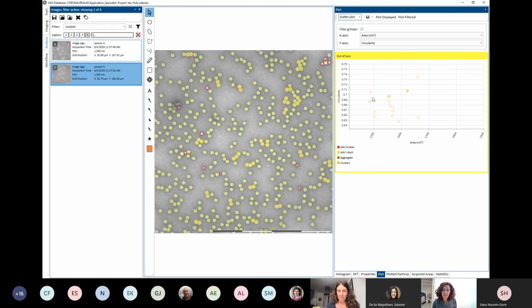Yeah, we like sections. They are a little bit more challenging, but it's actually something that we do quite regularly. The actual process to generate the grid, to generate the sample, is the one that is the most time consuming. We have 3 or 4 different applications that we can specifically use for this.